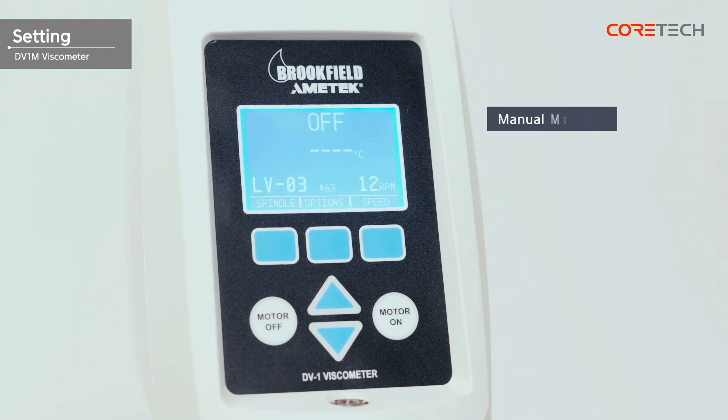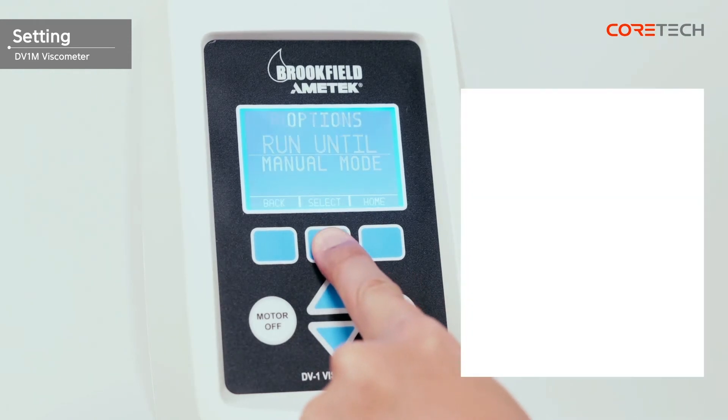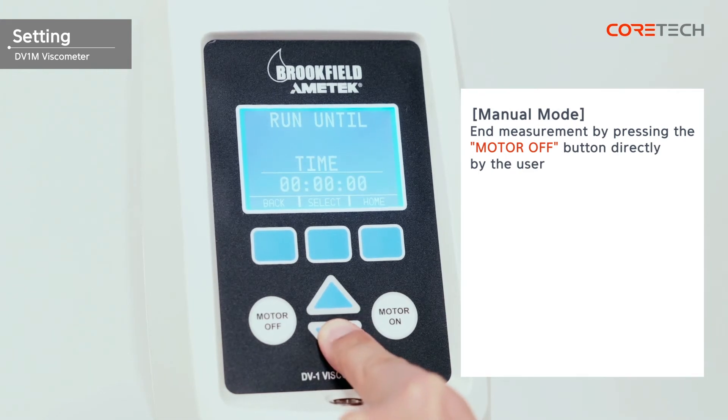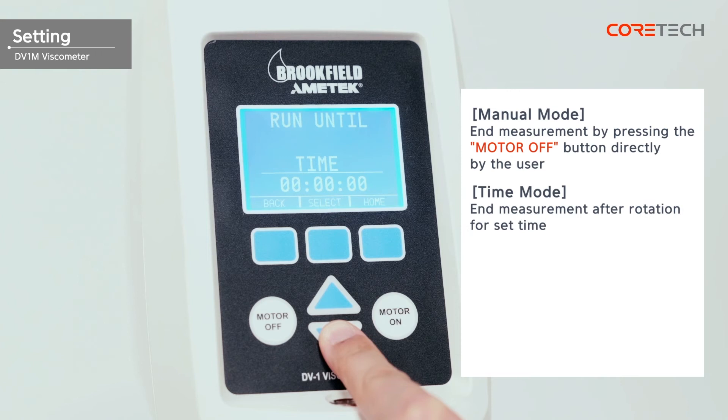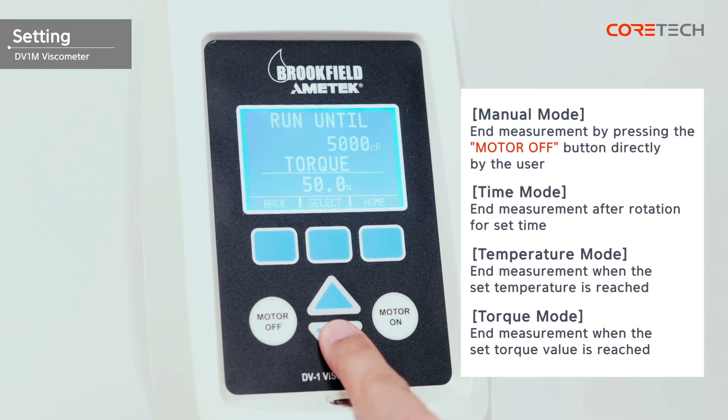The measurement modes include manual mode, time mode, temperature mode, and torque mode. In manual mode, the user directly presses the Motor Off button to exit the measurement. In time mode, the measurement is terminated after rotating for the set time. In temperature mode, the measurement is terminated when the set temperature is reached. In torque mode, the measurement ends when the set torque value is reached.